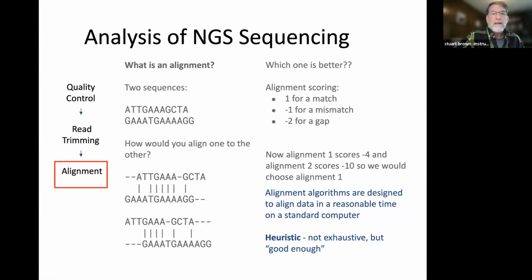It looks for a match, but sometimes the match is not perfect. Sometimes there is a low quality base in our read, and it's been substituted for a different letter. Sometimes there's a difference between the RNA that we're collecting from a particular organism and the reference genome for that same species. And so there'll be a mismatch.